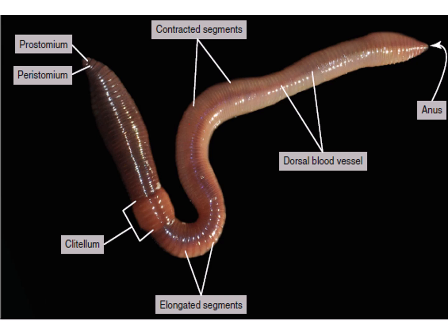On the head and tail we can see the segments, but they are only on the exterior side, but in the rest of the body these septa, or separations, are running inside also. So these are completely separate, independent segments.